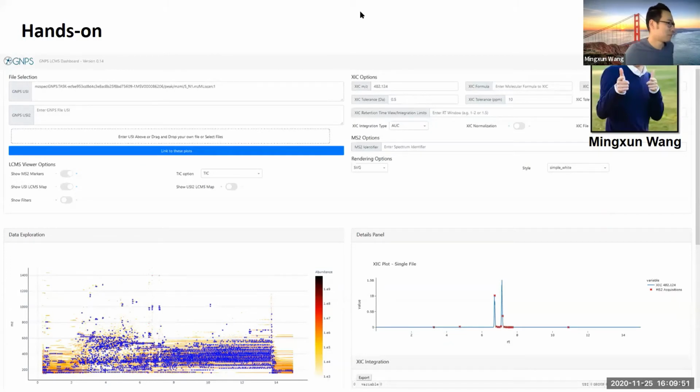Awesome. Thanks so much for stopping by, and especially thanks so much to Ming for building this new viewer. I think this is super helpful, and I hope that you will also find this helpful because it does not require you anymore to install some vendor software on your computer, but you can explore this data all in your browser. And the very handy thing, that link you just clicked on, I created for you, but that way you can create views for, I don't know, your coworkers or collaboration partners, and all they need to do is click on it and they can see the raw data.